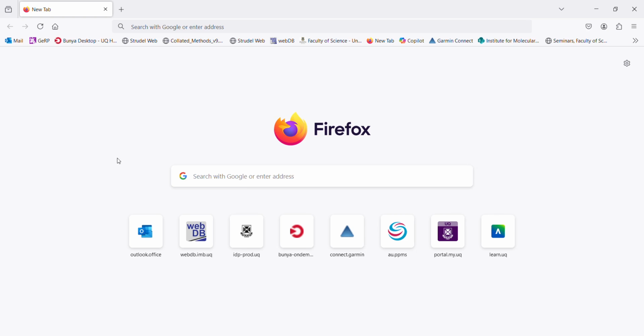Hello, my name is Farah, and today I'm going to be taking you through how to access Bunya's Visual Desktop service and how to get started with cryo-EM single particle data processing.